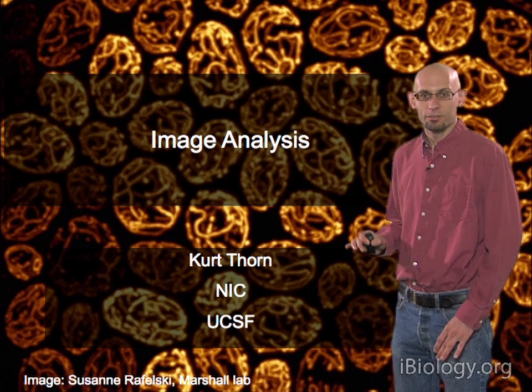And so the idea behind thresholding is that by just picking an intensity somewhere in this range, in between those two objects, we can separate this into foreground and background, into nuclei and background. So we would say maybe take everything above this value in this red box here. And now if we just color those pixels red on this image, you see we've picked out all our nuclei.